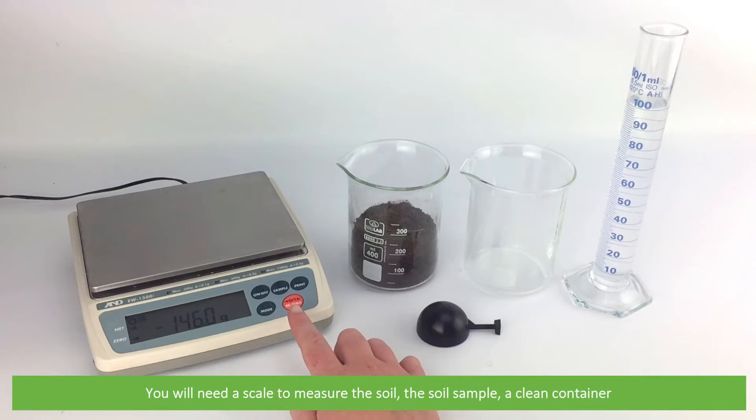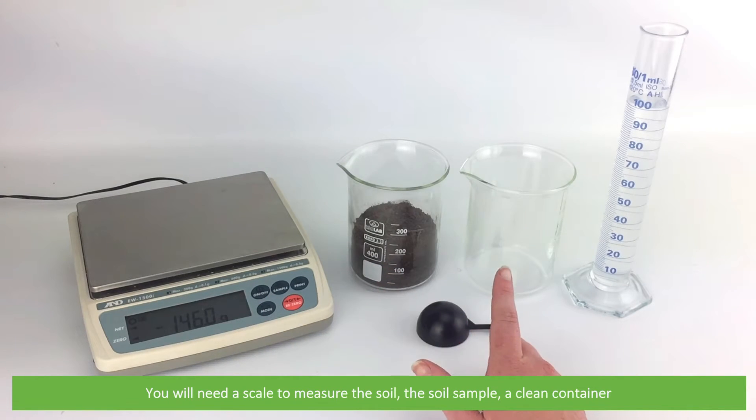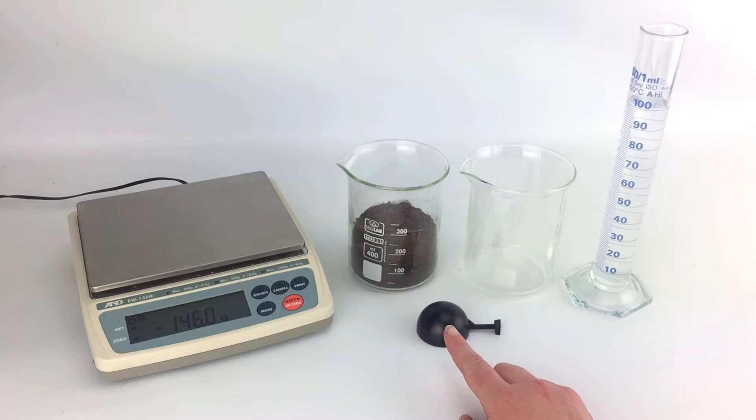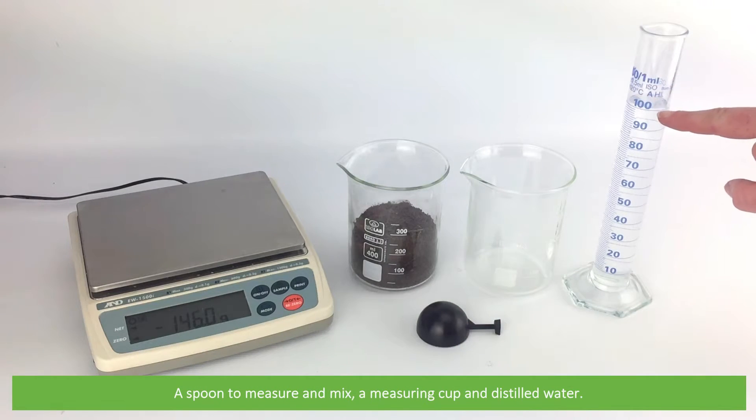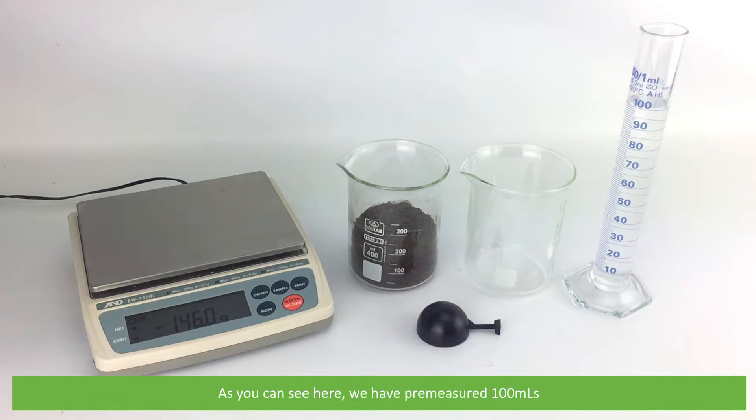To make the soil slurry you will need a scale to measure the soil, the soil sample, a clean container, a spoon to measure and mix, a measuring cup, and some distilled water. As you can see here, we have pre-measured out 100 mils.